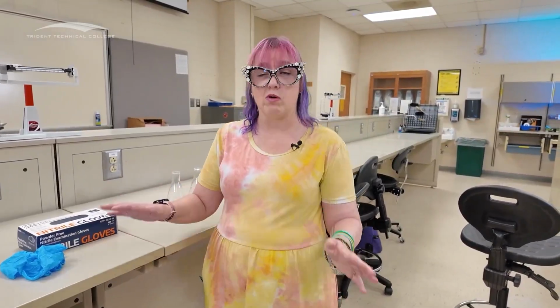When I come back to the lab, I'm going to go to the front bench. I'm going to wash my hands again, just because I'm paranoid. And then I'm going to put on another pair of gloves, and I'll do that before I handle anything in the normal part of the lab. Okay, because chemicals can be just about anywhere. So we want to make sure that we're dealing with clean hands before we put them back into those gloves.